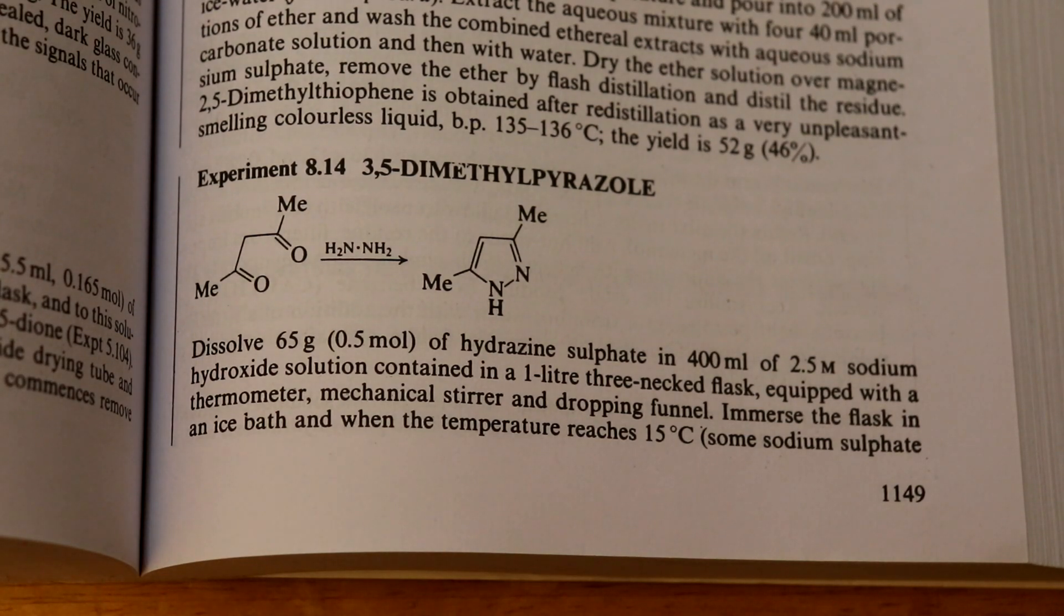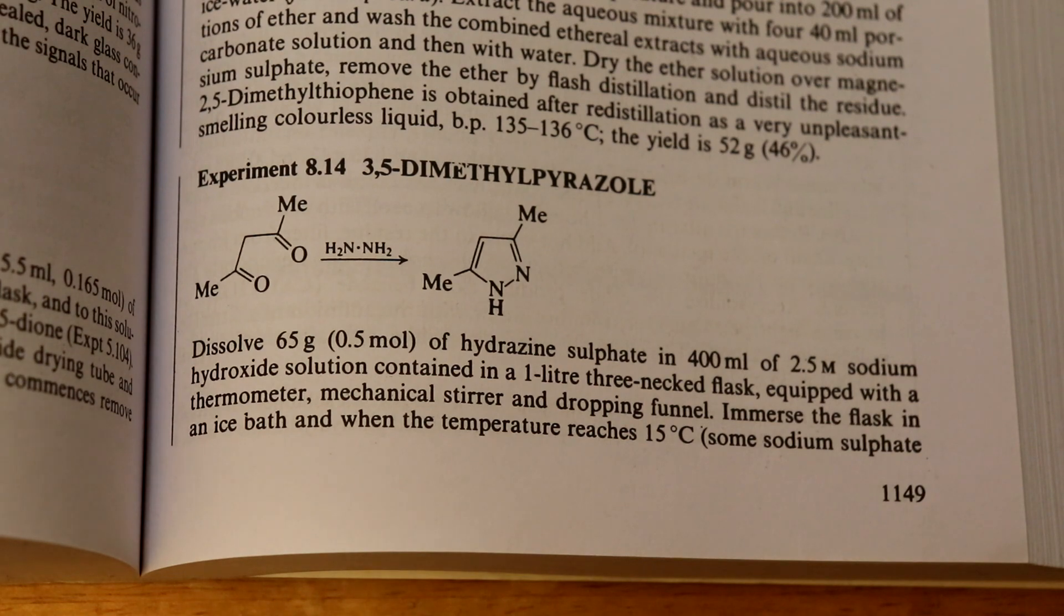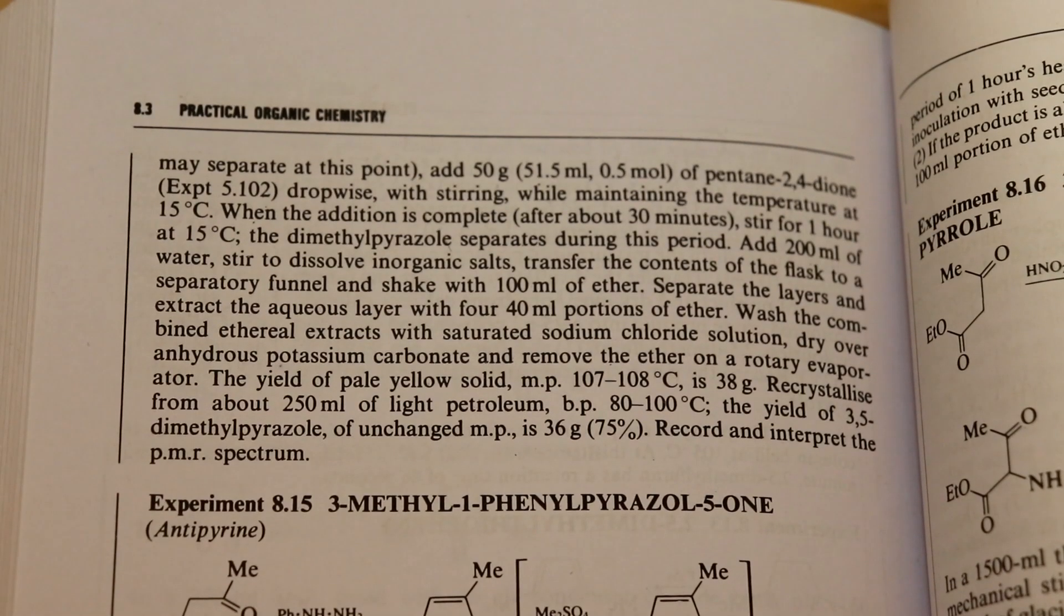In this video, I'm going to be making 3,5-dimethylpyrazole via the condensation of hydrazine with acetylacetone, following the procedure laid out in Vogel's Practical Organic Chemistry at half scale.